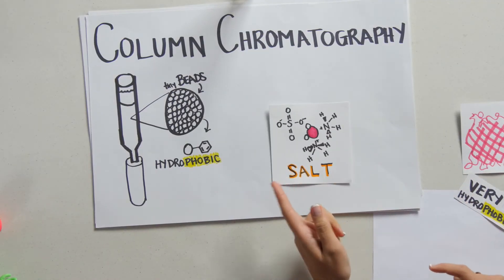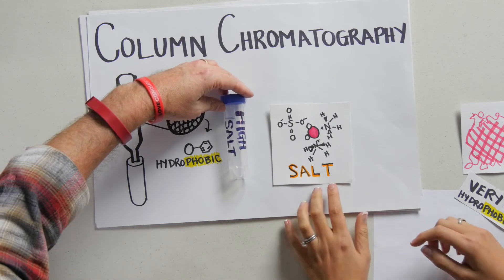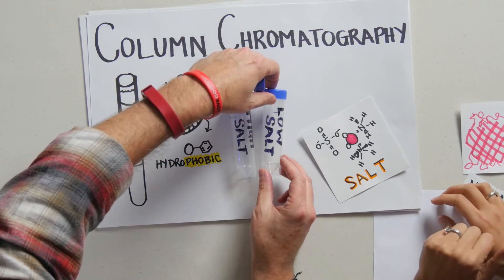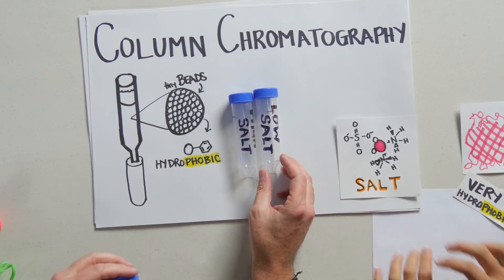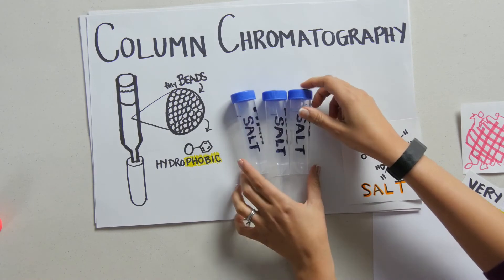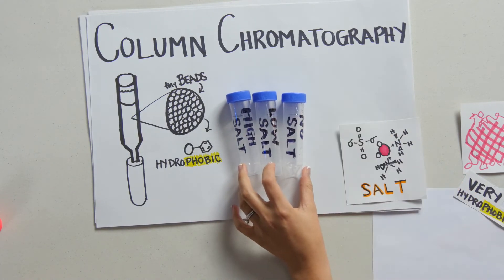And we're going to use salt to help us out. So we have a high-salt solution. We have a low-salt solution. And we have a no-salt solution. So these different concentrations of salt are going to help us sort our protein.